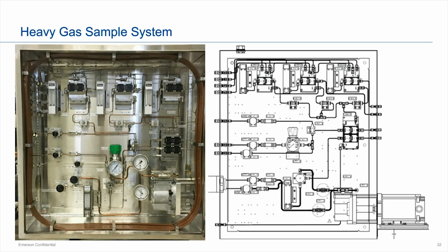And the reason they have the ARVs is, again, it has H2S, so they are likely venting to flare versus venting to atmosphere. And our sample loops in our GC need to vent to atmosphere to equalize, to have a consistent sample size. And so an ARV allows us to equalize our sample loop to atmosphere without actually venting the sample to the atmosphere.